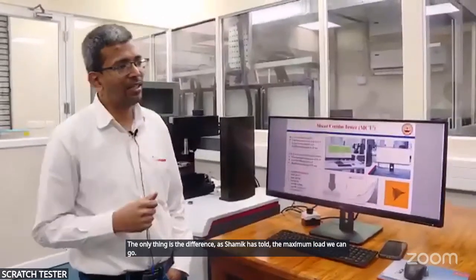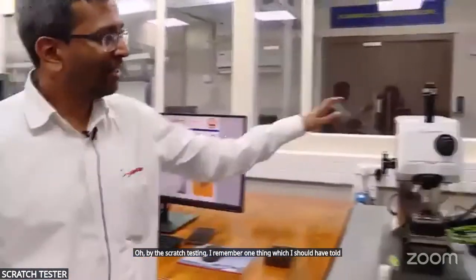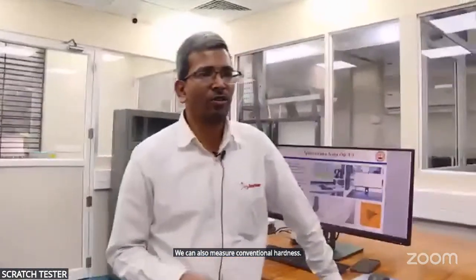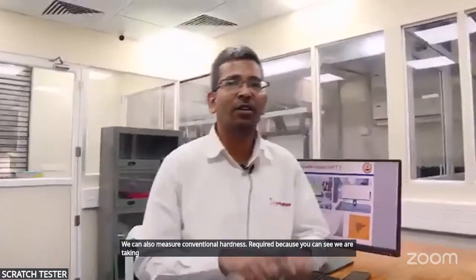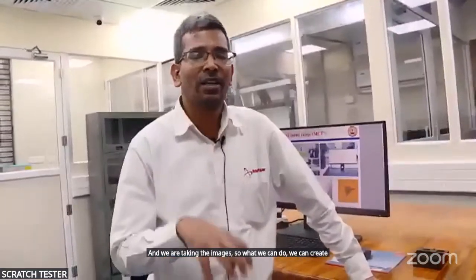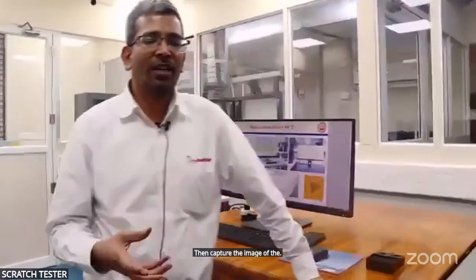About scratch testing, I remember one thing which I should have told: with scratch tester mode, we can also measure conventional hardness, because we have the optical microscope and we are taking the images. We can create an indent impression, then capture the image of the impression to get the optical hardness.